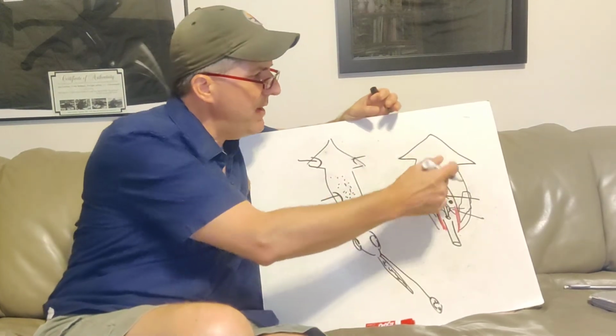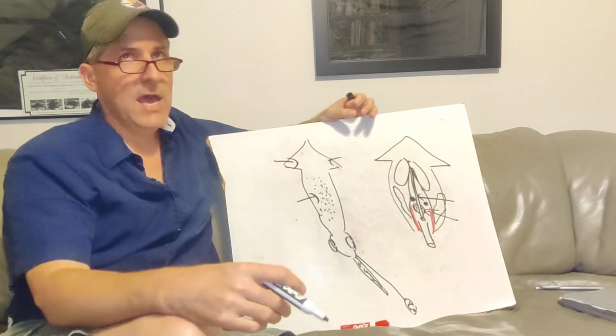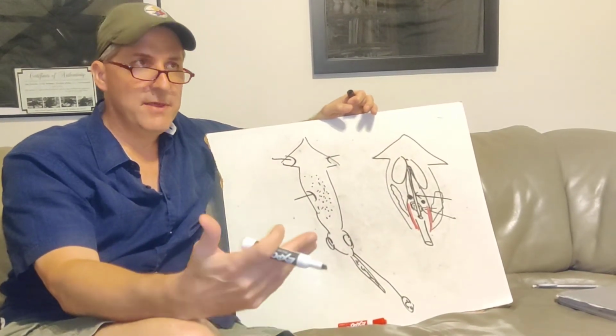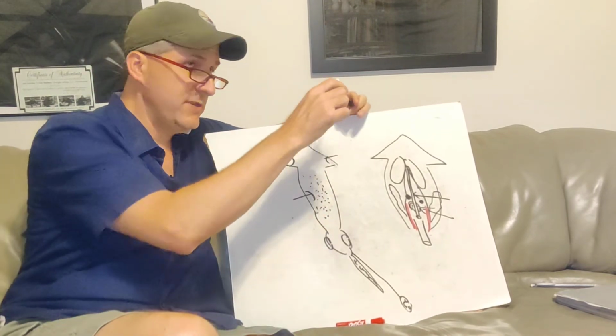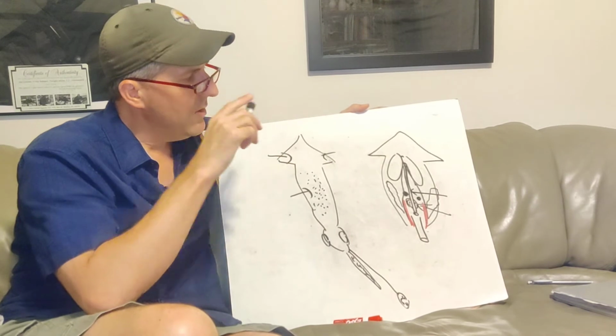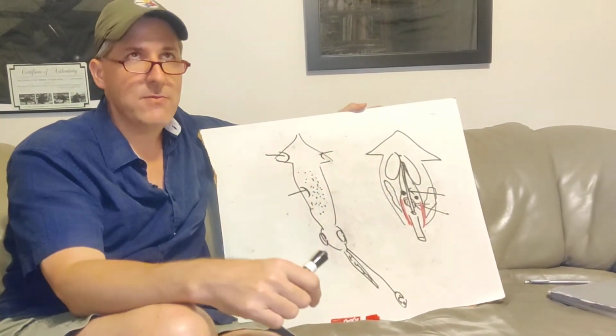Now, up above this, you'd have the gonads up here. Okay? Now, again, if it's a female, ovaries making eggs. If it's a male, it's going to be the testes for sperm production. Separate sexes. Not a hermaphrodite anymore. Now, how do you tell the difference? Usually you can do it by texture as well as color.